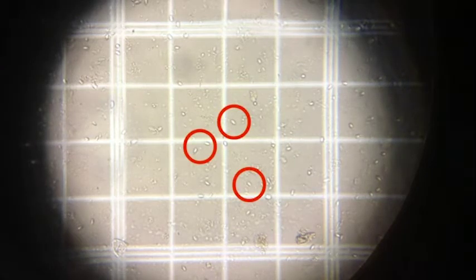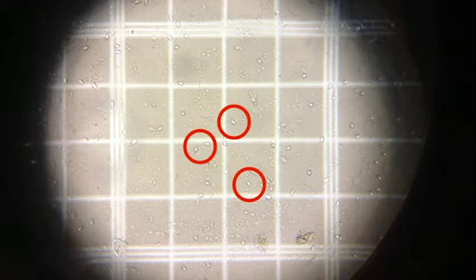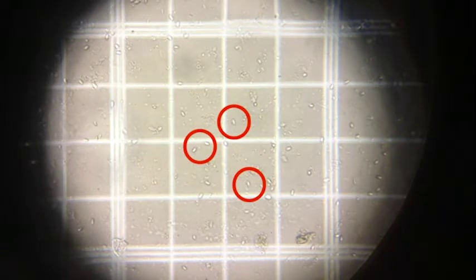Here are some highlighted Nosema spores. Become familiar with their distinct shape and outline. It may take some practice to decipher spores from other debris within the sample.